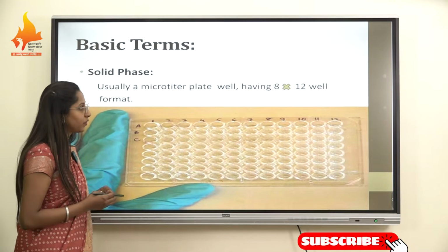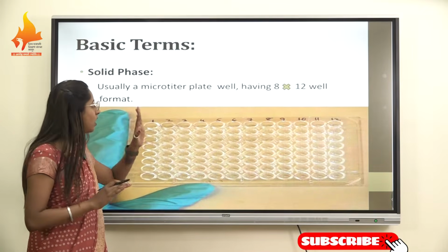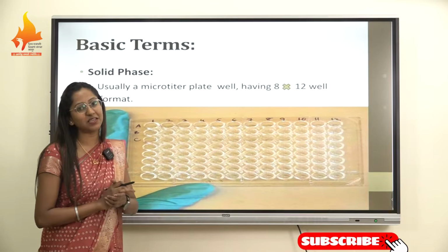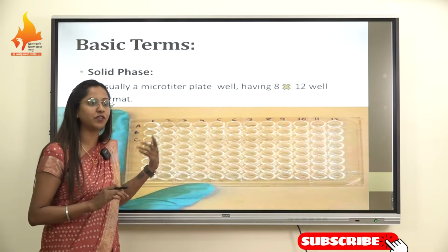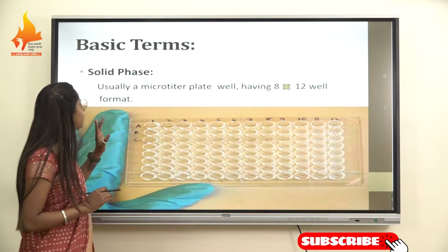Moving forward, before we deal with the different types of ELISA, we have to know about the basic terms which we are going to use. What is the first basic term?